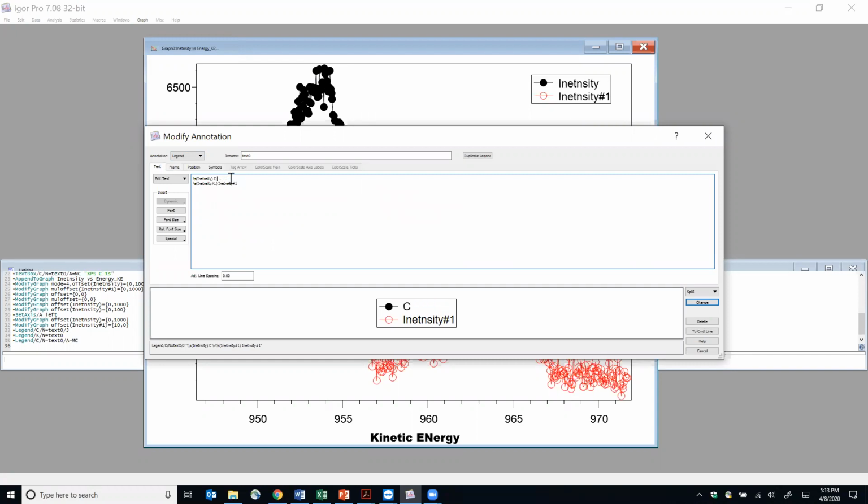For example, we did like before treatment. Yeah, you put P after F. Yeah. There you go.